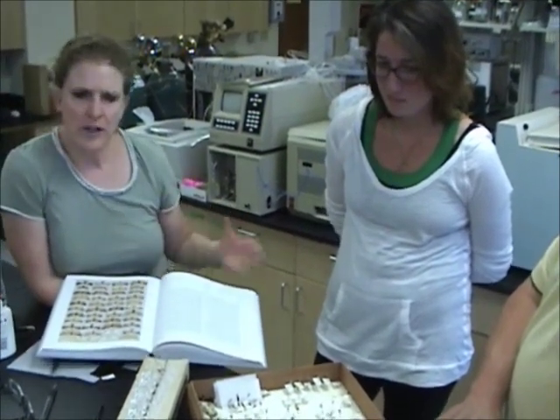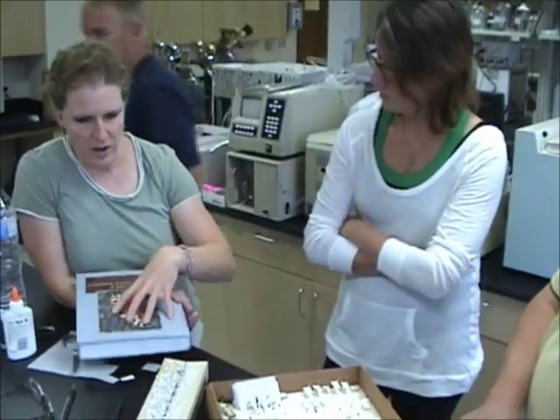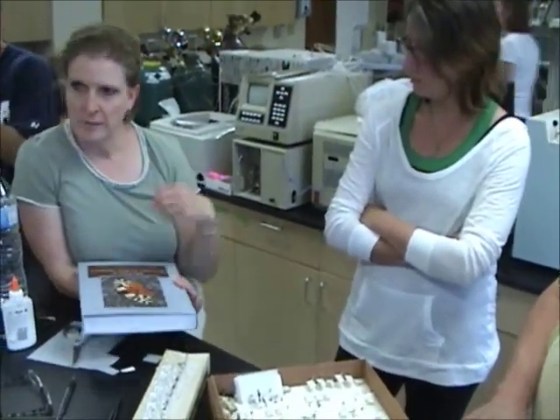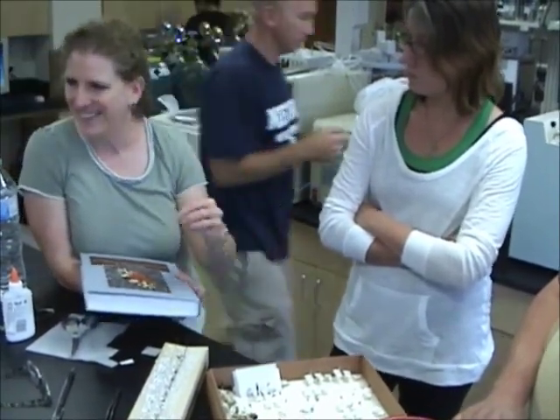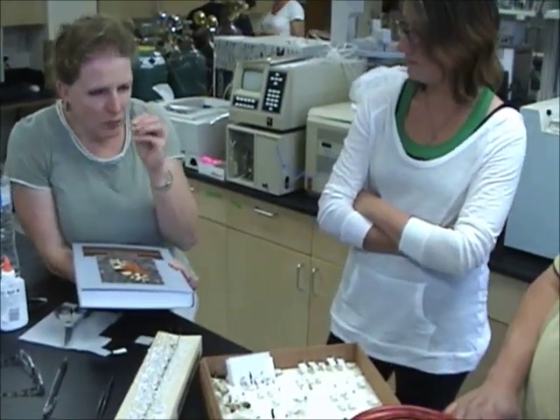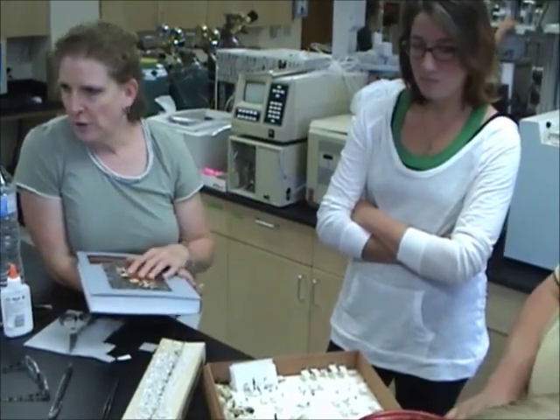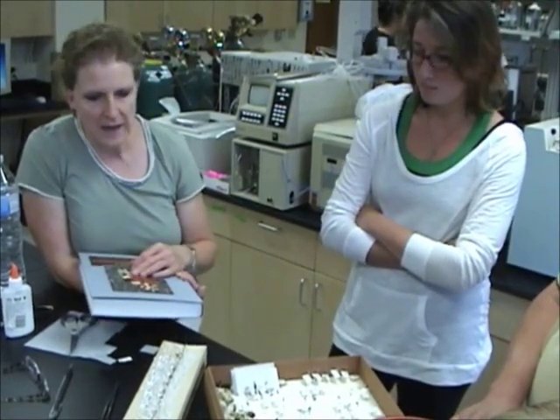Different people want to do different things with them. Traditional taxonomists will look at the genitalia housed in the abdomen and make species determinations based on that, which is obviously insane and painstaking — you're looking at a dissecting scope making really tiny morphological comparisons. One of the newer things is to do PCR with DNA sequencing.